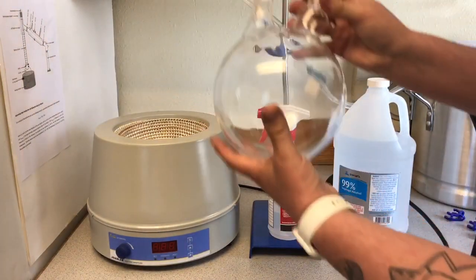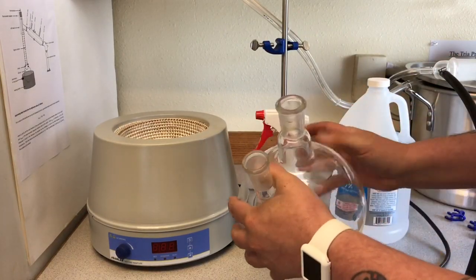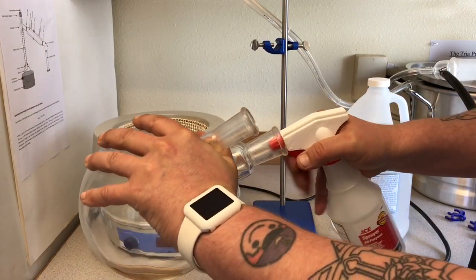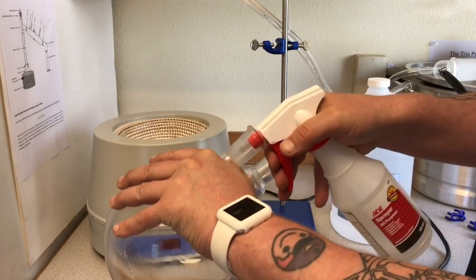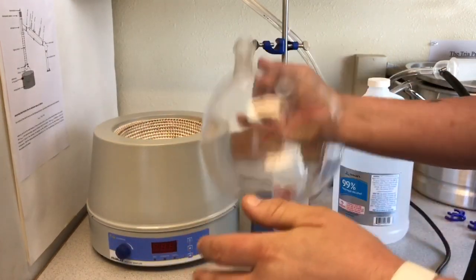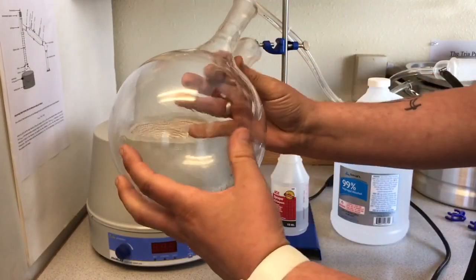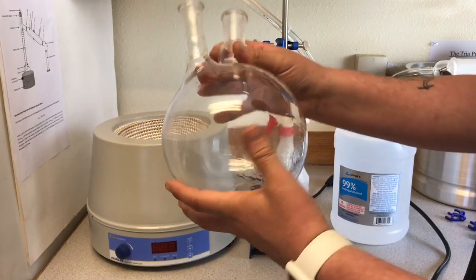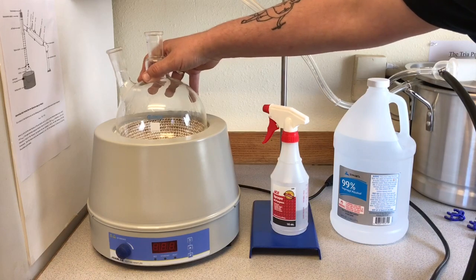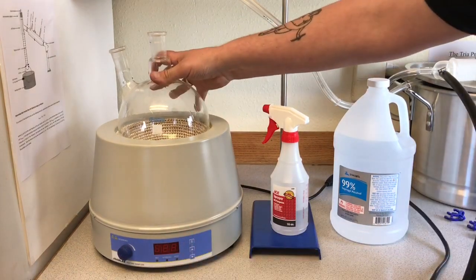So we can just grab our round bottom flask. You want to be very careful with your glassware not to do anything dangerous, and we can just start with spraying some alcohol in here. And the reason for the 99% alcohol is it will dry 100% clear. So just spray a little bit of that in there, and that'll clean this guy up. And we'll set our round bottom flask into our heating mantle.